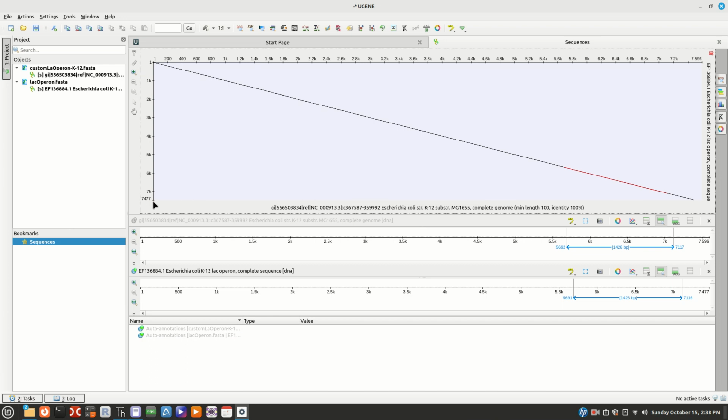If you were doing it this way, 100 into the previous gene, or into the next gene, on either side. So if I were to do this again on the NCBI, I would have maybe 100 base pairs on either side, just to make sure that you got everything.